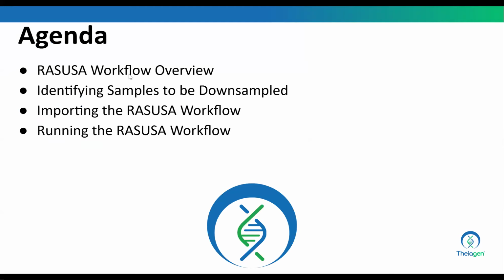In this video, we'll give an overview of the RASUSA workflow. We will describe how to identify samples that need to be downsampled. We'll go over the process briefly of importing the RASUSA workflow into our workspace, and then we will cover how to configure and run the RASUSA workflow.